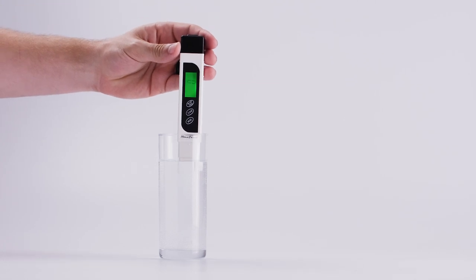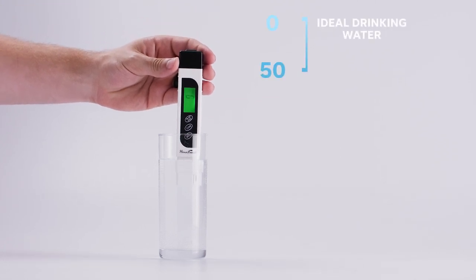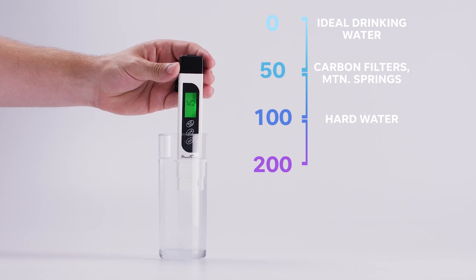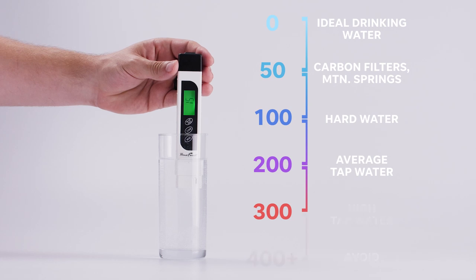Simply turn it on and insert the tip into the water you're testing. The lower the number the better. Distilled water reads zero. Anything above that up to 100 is an acceptable range, but 100 is considered hard water. In the middle of that range, around 50, is what you would expect from carbon filters and mountain springs. Above 400 is what you want to stay away from — that's too many extra particles. Unless you know you're adding something to that water like minerals or electrolytes, you want to stay away from this range.